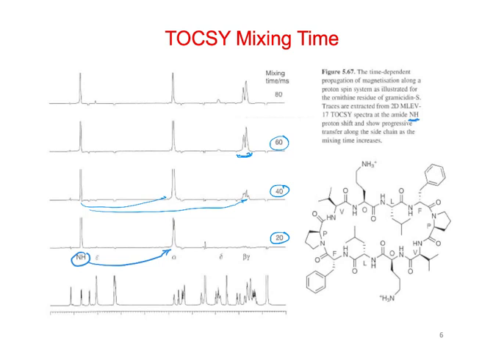And we go up to 80, and this delta signal starts coming in. So alpha, beta, gamma, delta. I think it still might be the ornithine here. So we're going off the NH to the alpha, then to the beta, gamma, delta.